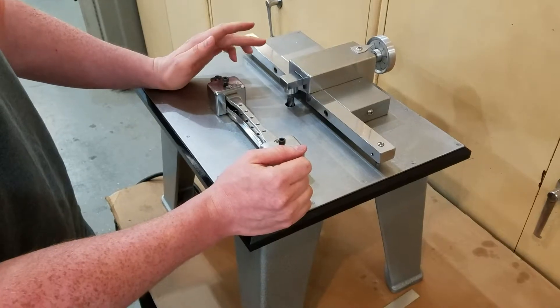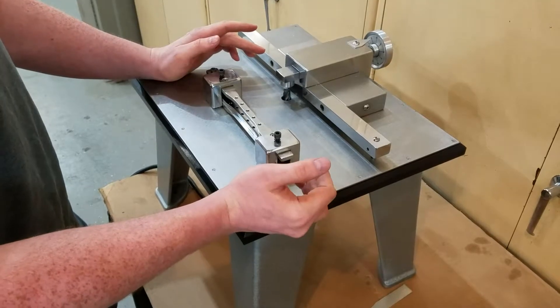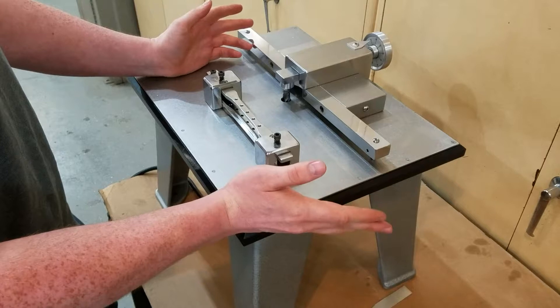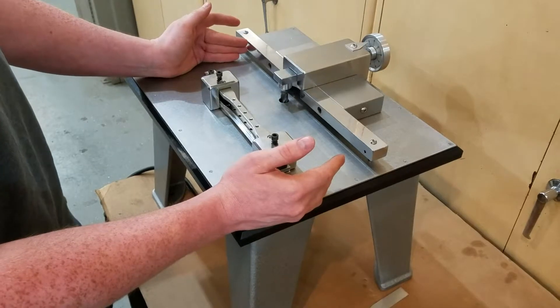This particular machine is our most basic model. There is no vacuum slot — if there were, you wouldn't have to worry about the chips as much. And there is no mist on this particular one. Both of those are things you can get put onto these machines, and they are also included in our higher-end models.